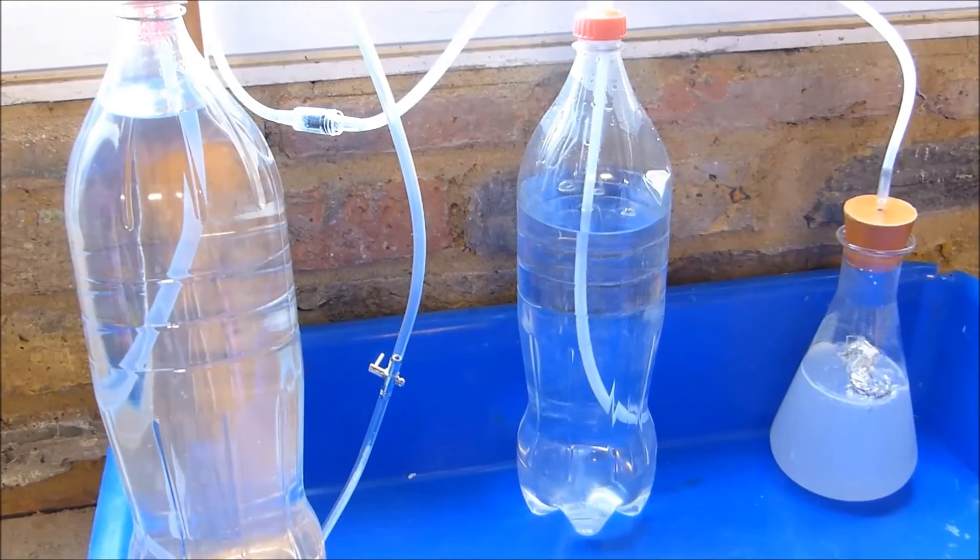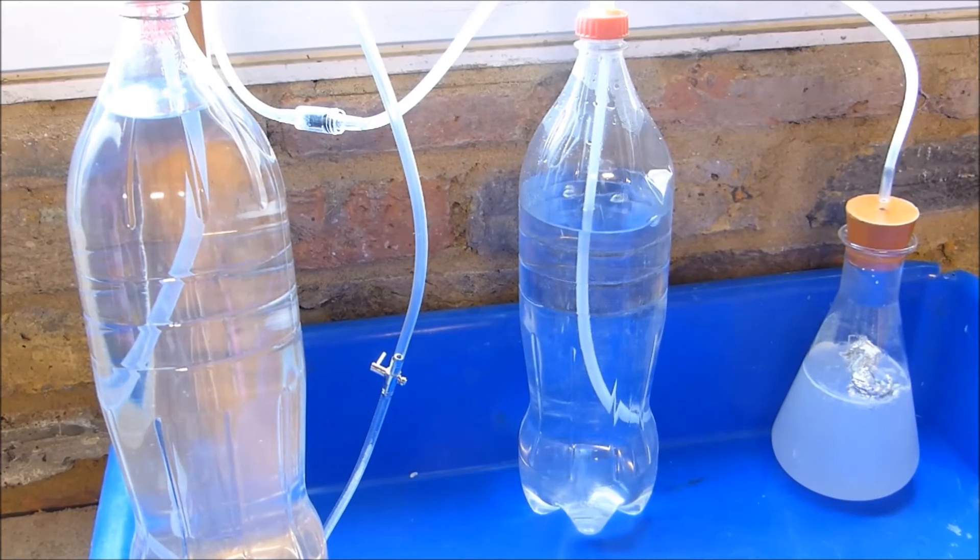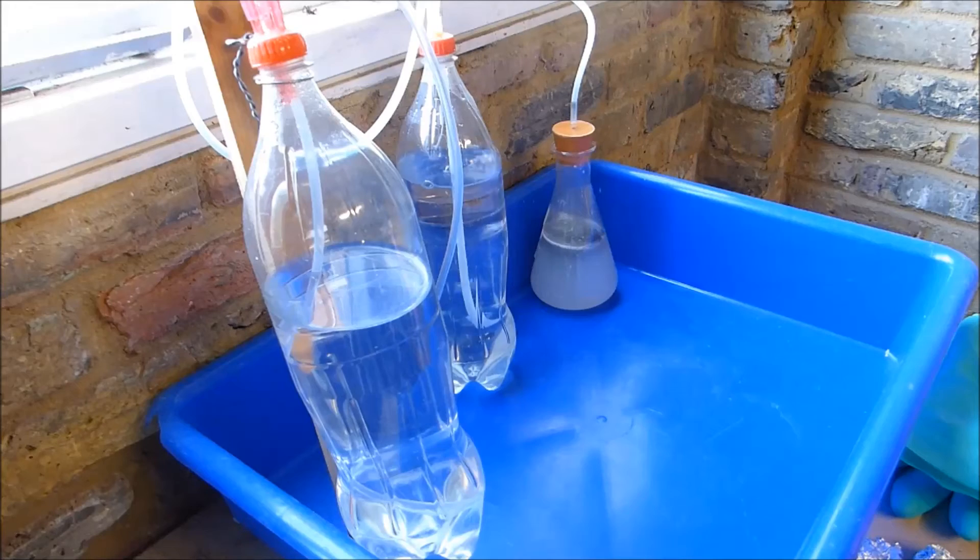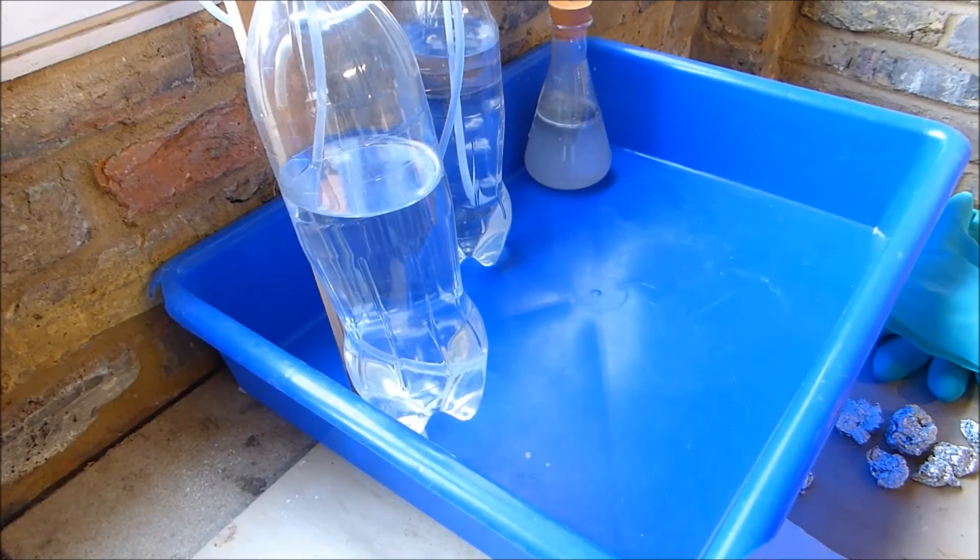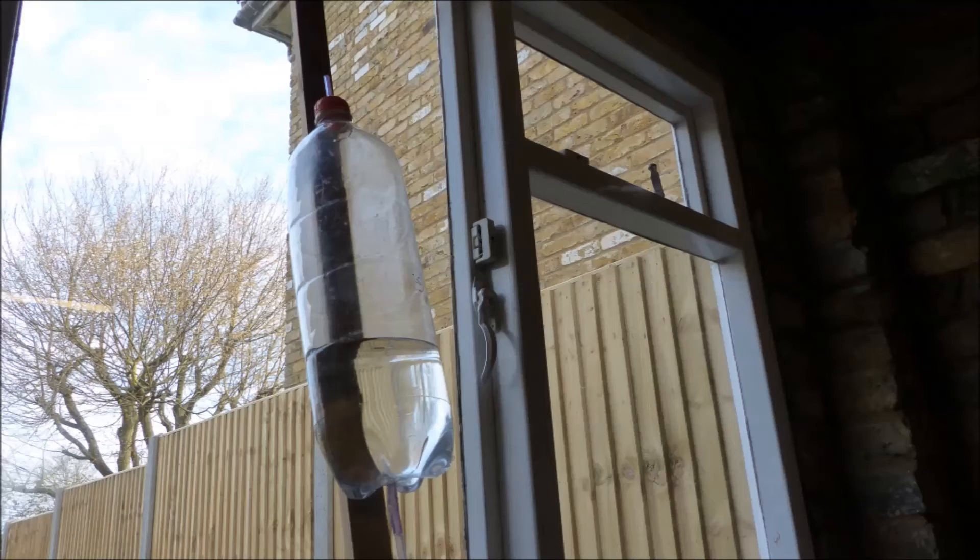The reaction starts off slowly at first with a small but steady stream of hydrogen passing through the bubbler. As production increases, the hydrogen is stored in the bottle on the left and the water displaced into the bottle above it.